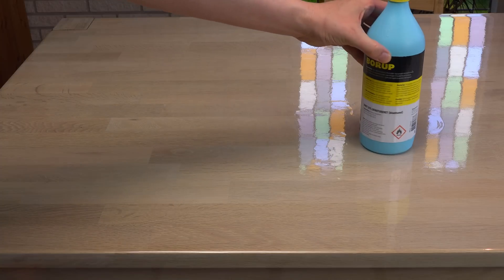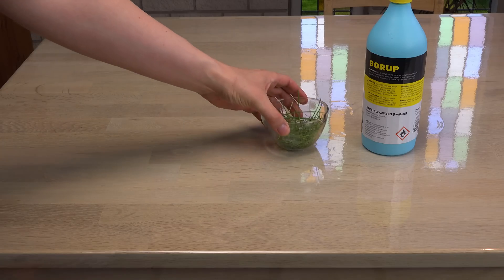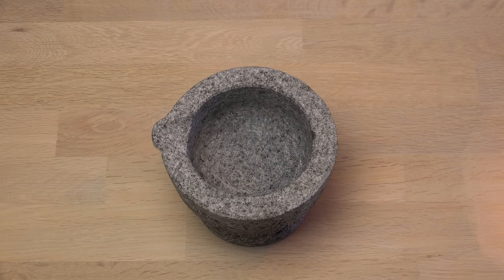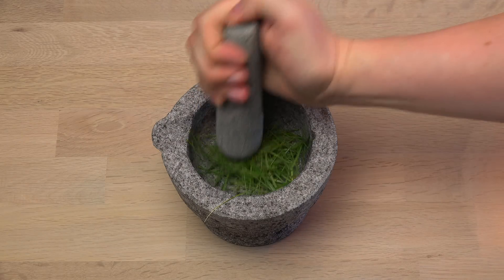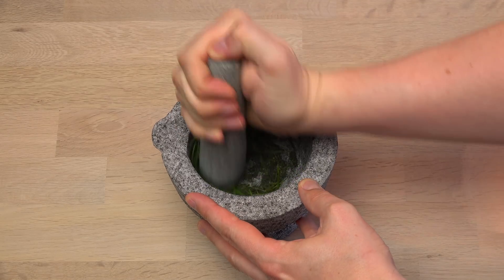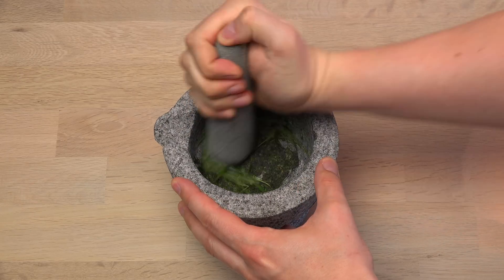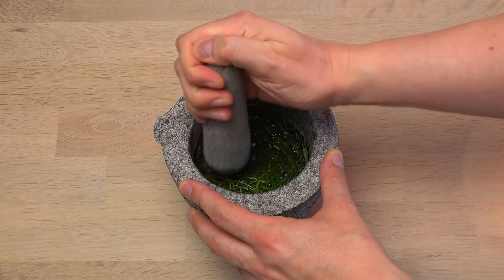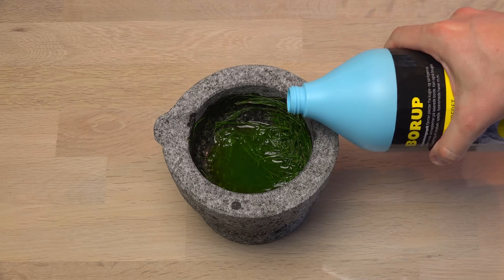Let's instead try and extract the chlorophyll using ethanol and some grass from my lawn. First I crush the grass in a mortar — not because it is technically necessary, but it'll speed up the extraction. And I always wanted an excuse for muddling something to smithereens in a mortar. Vikings don't need food processors. That's the smell of springtime: freshly mown lawn and a liberal amount of alcohol.